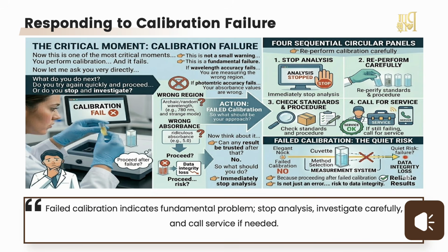No. So what should you do? Immediately stop the analysis. Reperform calibration carefully. Check standards and procedure. If still failing, call for service, because proceeding after failed calibration is not just an error, it is a risk to data integrity.